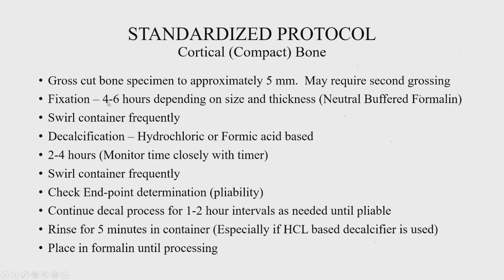Swirl the container, decalcification. We're talking about some of the stronger decalcifiers here. 2 to 4 hours, monitor it closely, swirl the container, check the end point. If it's not ready, you continue the process for 1 or 2 hours more, and you rinse for 5 minutes, as we said before. Very specific. You have to set timers for these. You can't just walk away and, oh, I forgot about it. You need to set timers to monitor it closely.